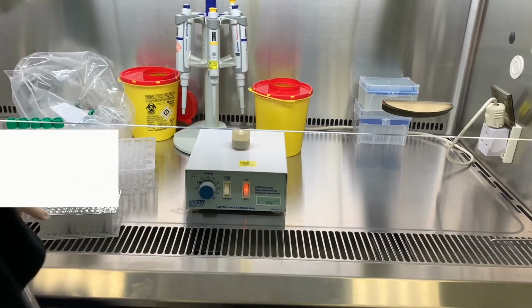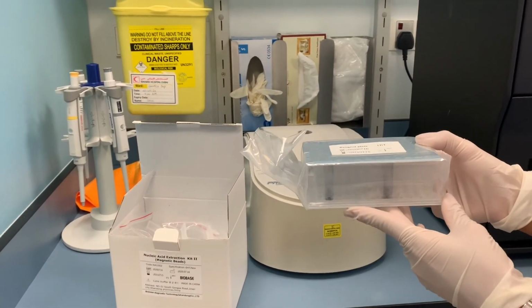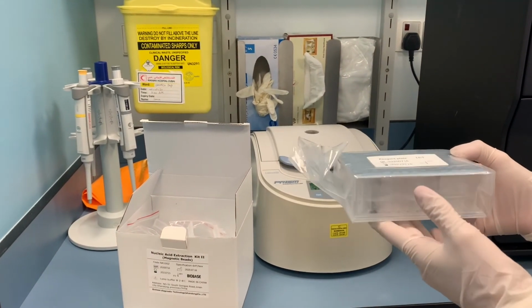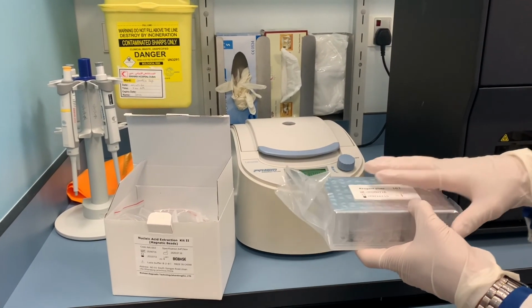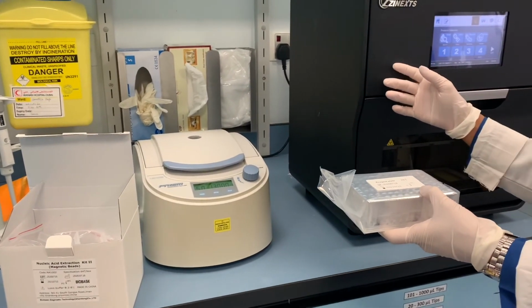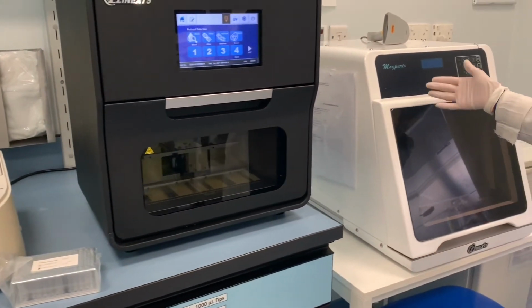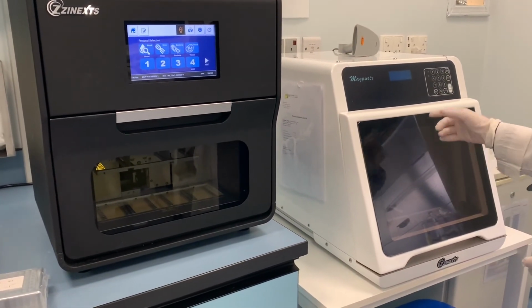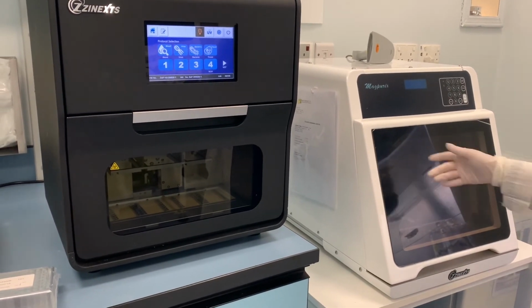In this lab, the black machine is used more often, and that is because more samples can be processed by this device in lesser time. The advantage of using the white machine is that it can process samples individually.